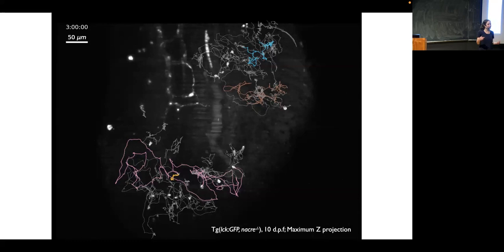The short answer is yes, we have definitely thought about it. I think microinjection, for the most part, would cause a systemic response because it goes to circulation quite fast. There might be related techniques where you could inject into tissues, for example, that might cause an interesting local stimulus. So yeah, it's a great idea.